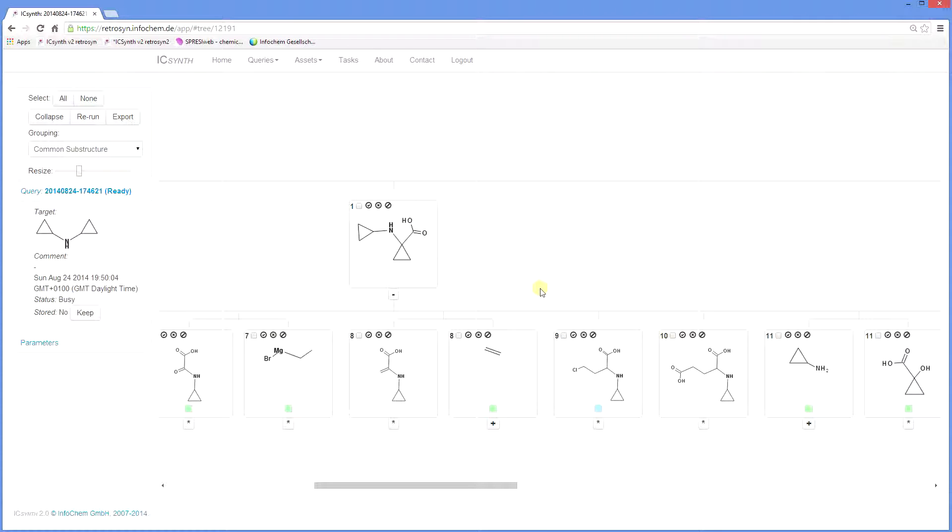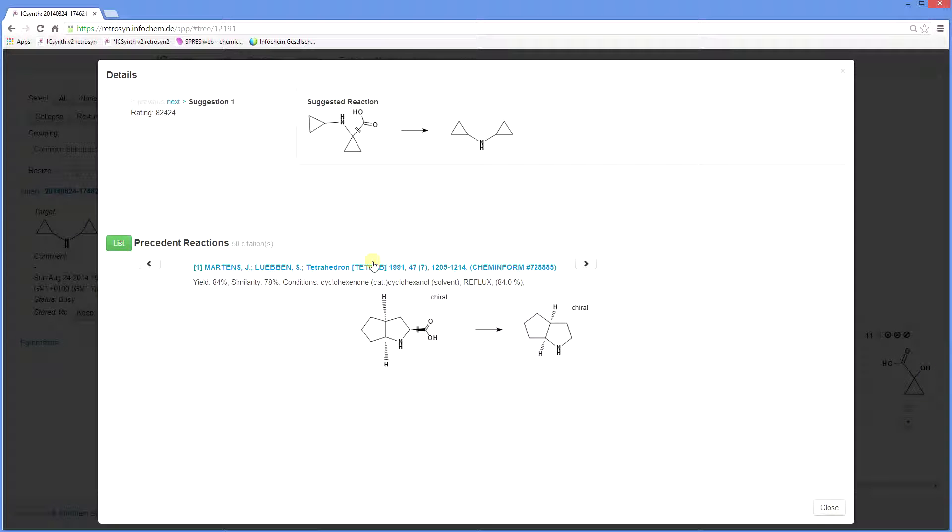The hand icon collapses and expands the tree at a given level. You are now in a position to evaluate the results and decide which synthetic pathways are the best to follow through. By clicking on the node, you can see the precedent reactions and reference details.